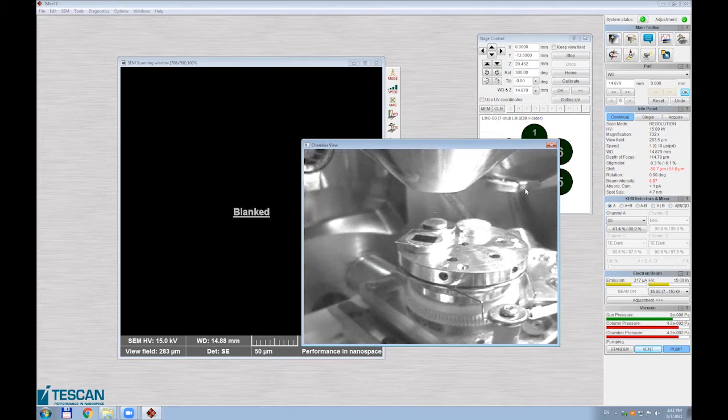So now I will place it back. So till we wait for a good vacuum. Any question for now? Not yet? Okay, cool.